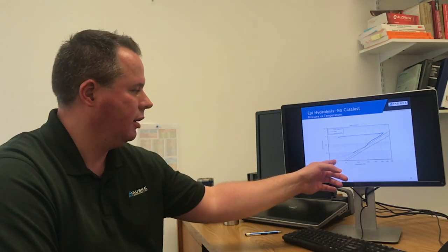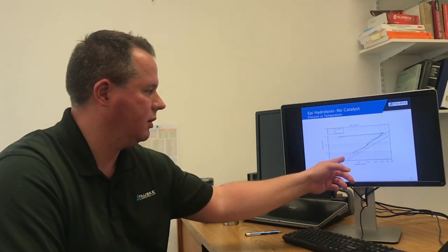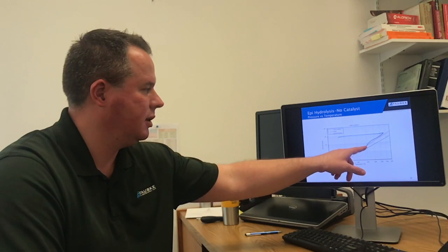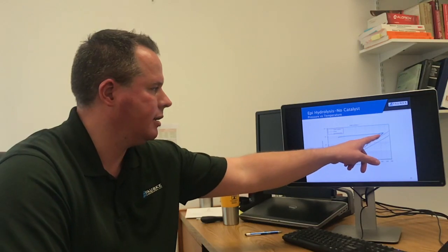So again, we had a little bit of a pad gas, but not very much here. You can still see it mostly essentially follows the vapor pressure of water. And then at the 150C, where we saw that secondary reaction occur, it does look like it probably generates some non-condensable gas, and then continues heating up here as well.